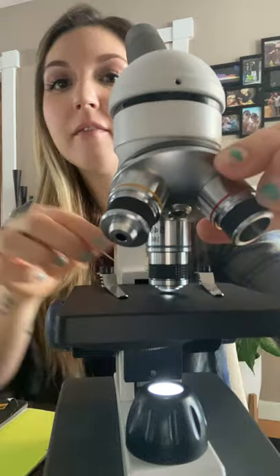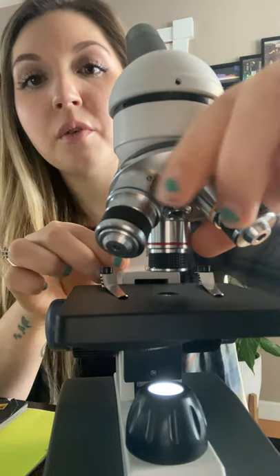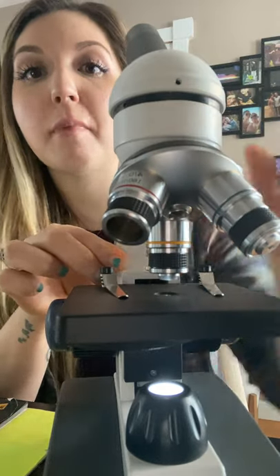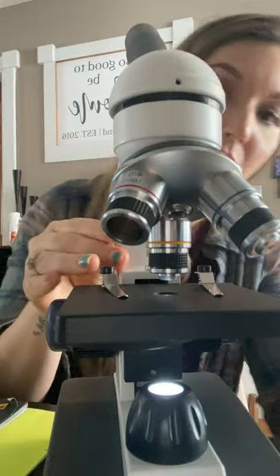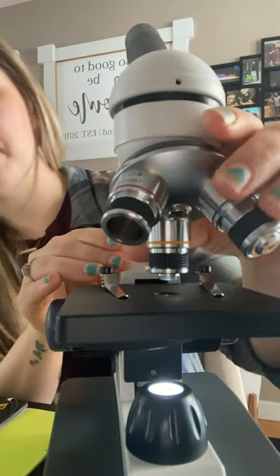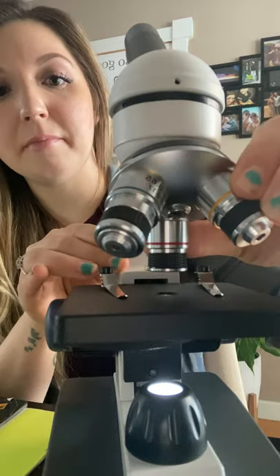Next we have the revolving nosepiece which the objective lenses are on, and you are going to turn this revolving nosepiece to switch back and forth between the different magnifications. We always start at the lowest, so we're going to bring it right back here to 40 times.